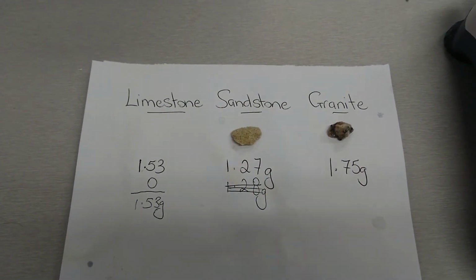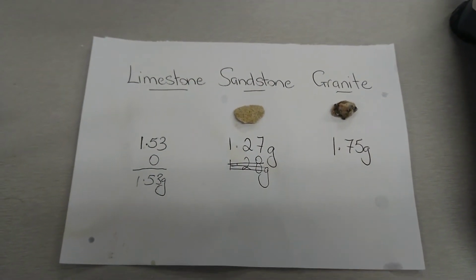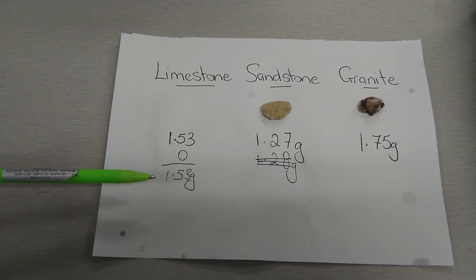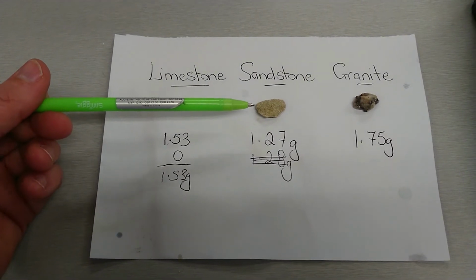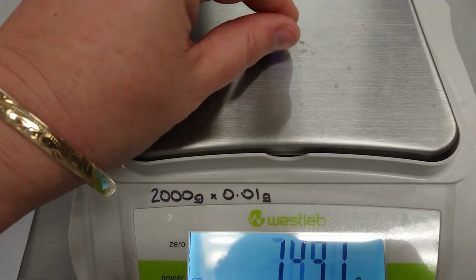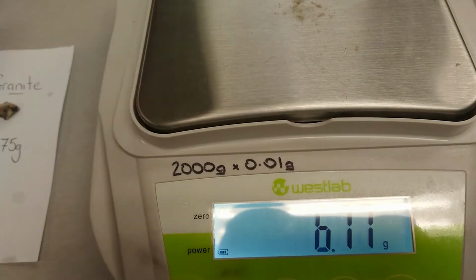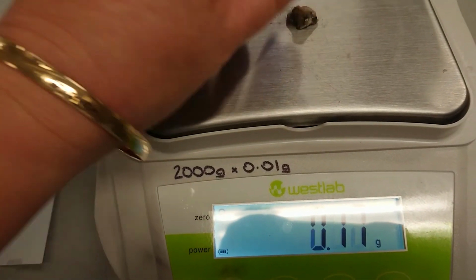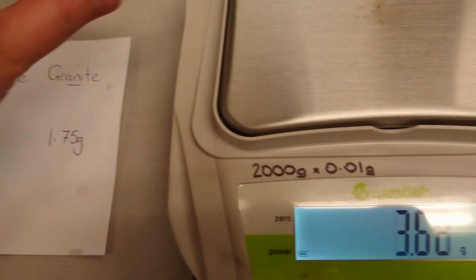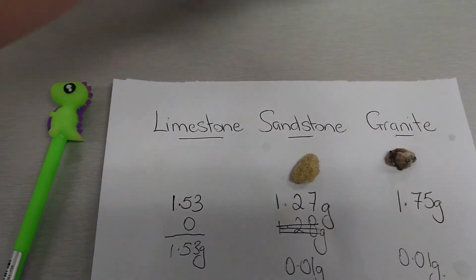Back again. Since I saw you last, the two samples have been washed and patted dry with a paper towel. Since we have no limestone left, the full 1.53 grams has dissolved. With the sandstone, we will measure it now and see what it comes to. 1.26 grams. The granite, 1.74 grams.